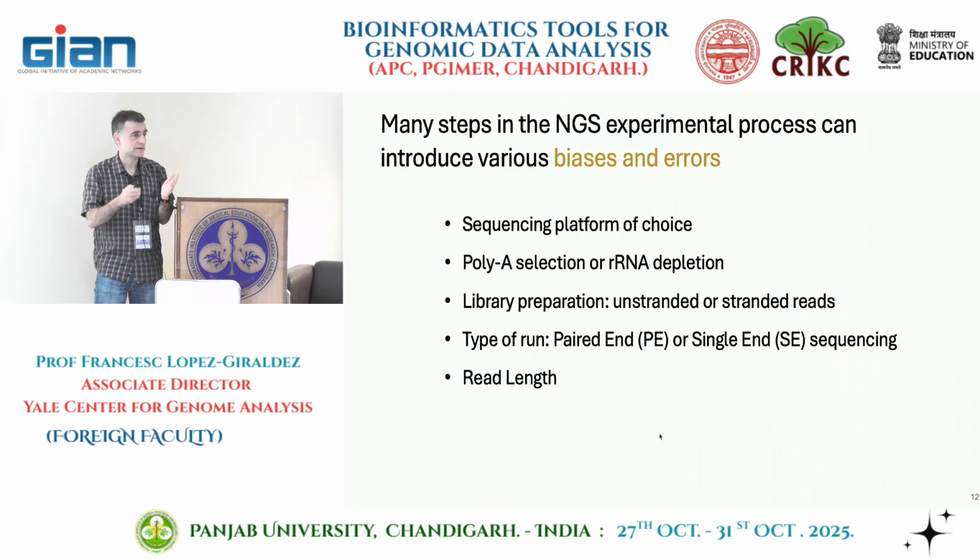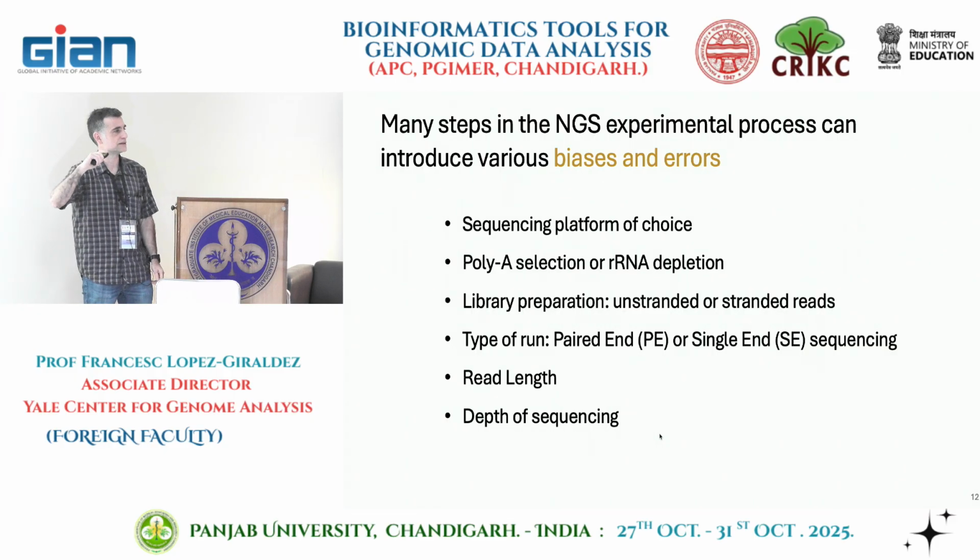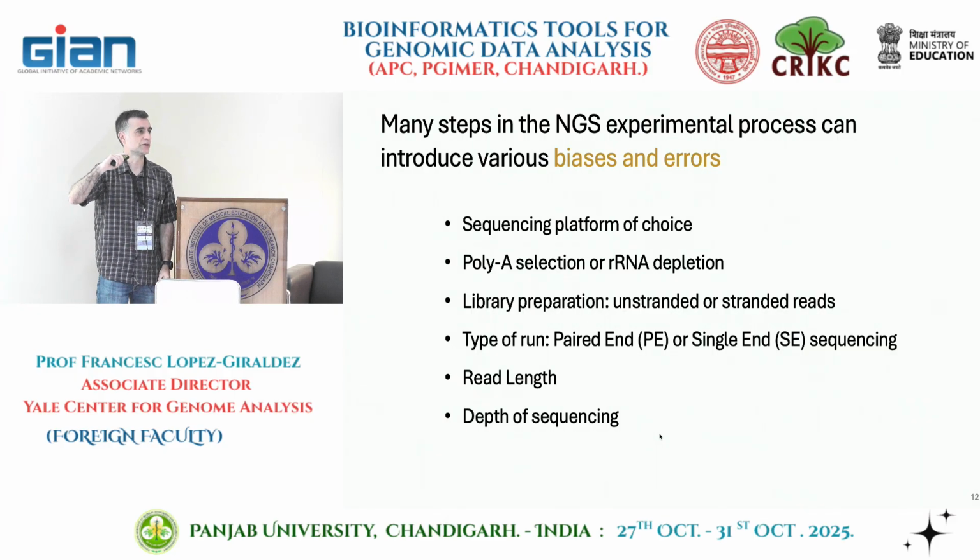The read length, we already talked about it. For bulk RNA-seq, short reads work. How much? We can talk about it later. Depth of sequencing, how much sequencing you're going to need. Can you think of something that is missing here? Maybe when you do bulk RNA-seq, or any kind of quantification study. Another important decision. At the beginning I said I could summarize all the problems we have as bioinformaticians with one slide. That's the thing that is missing here.